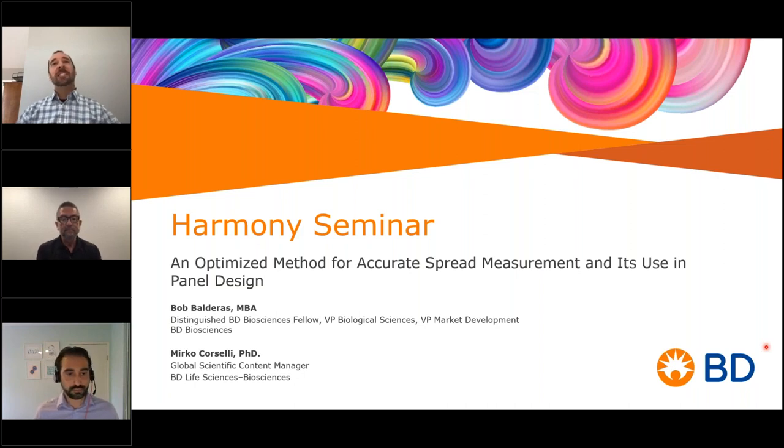The webinar today is entitled An Optimized Method for Accurate Spread Measurement and Its Use in Panel Design.